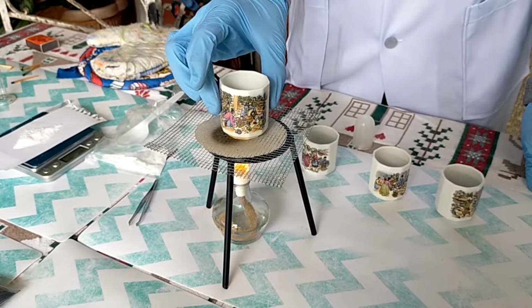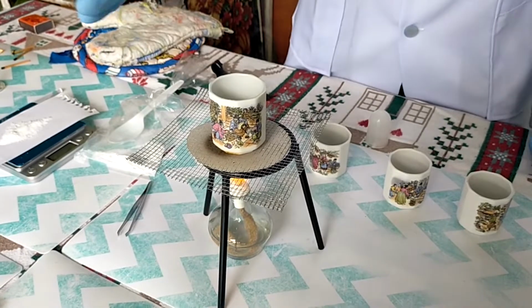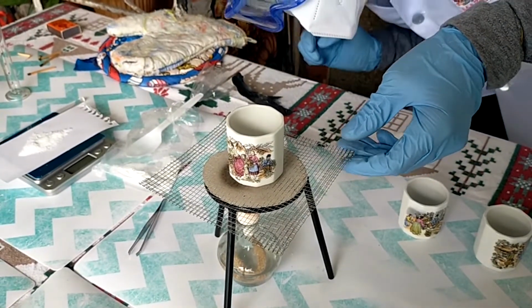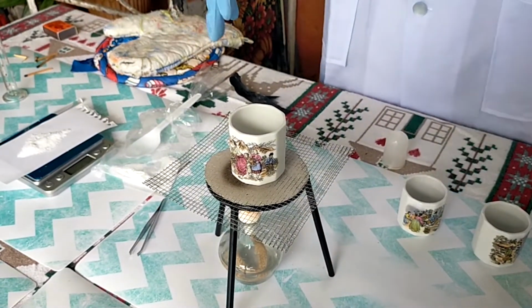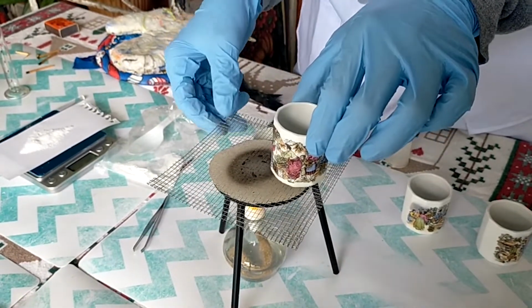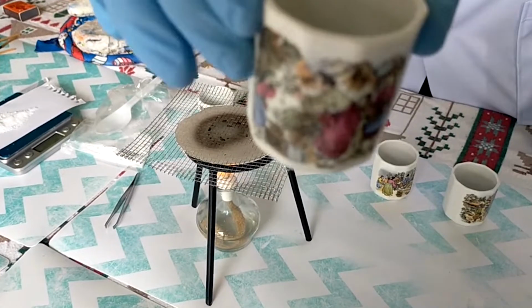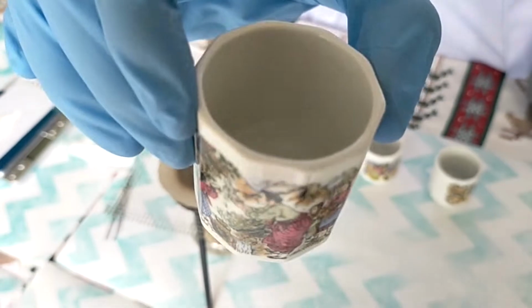As you can see, heating the water does not change its solubility, so we will test the other three in the video. Okay, so this is for the IPA, and you see that heating has diminished the amount of naphthalene here.